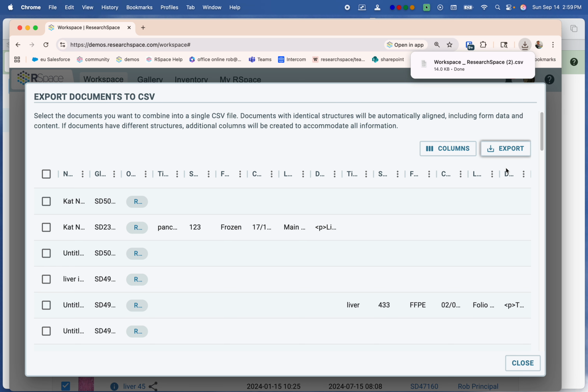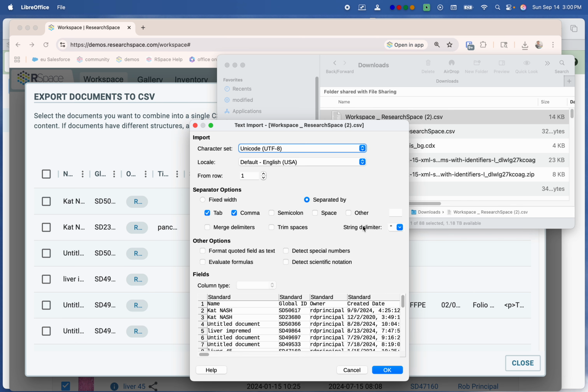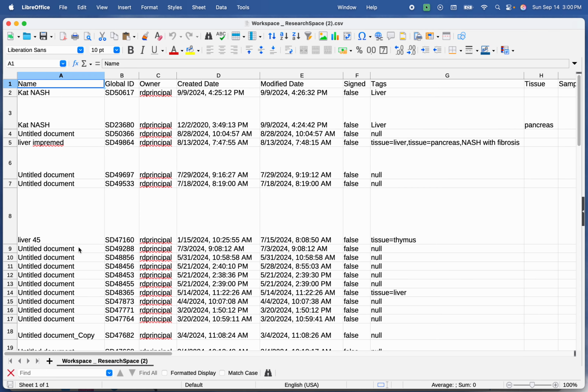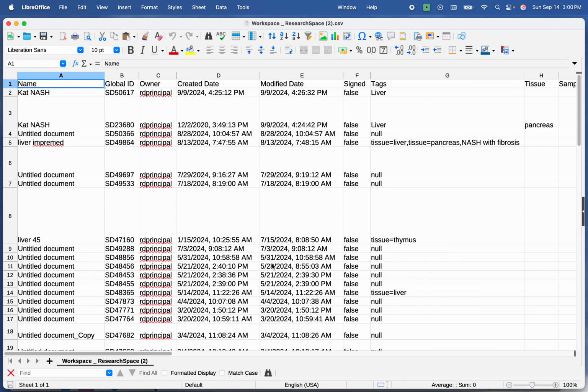Now, this particular CSV file isn't going to contain anything particularly chemical related, to tell you the truth, but one can imagine that when we look at this CSV file now, what we have here is a sequence of experiments with each column representing some variable or metadata category and each row representing a single experiment. And now that I've got this in CSV format, I can sort this data, or I can perform functions on it.